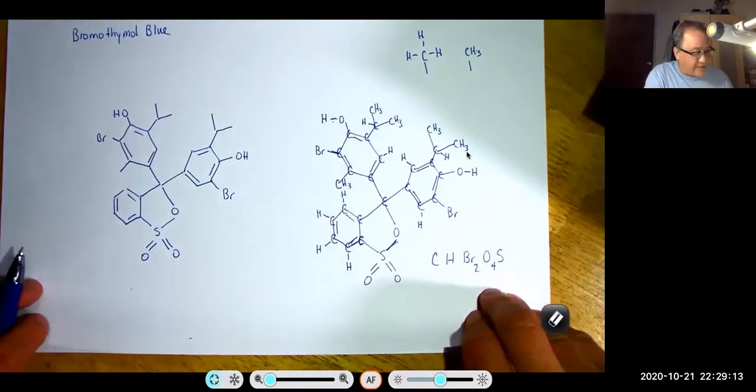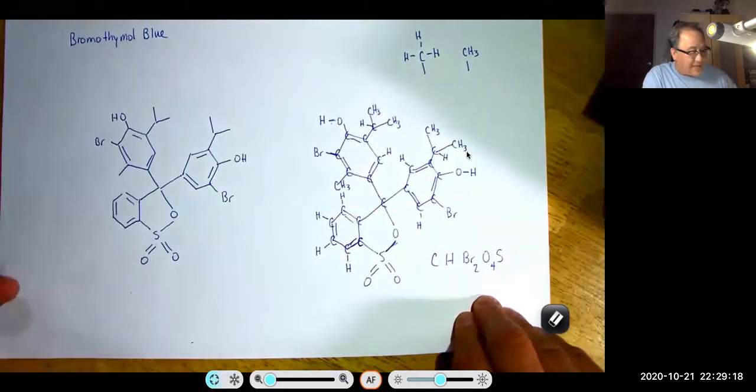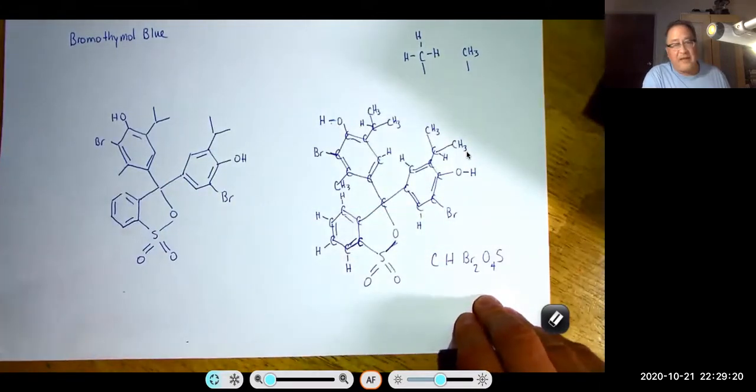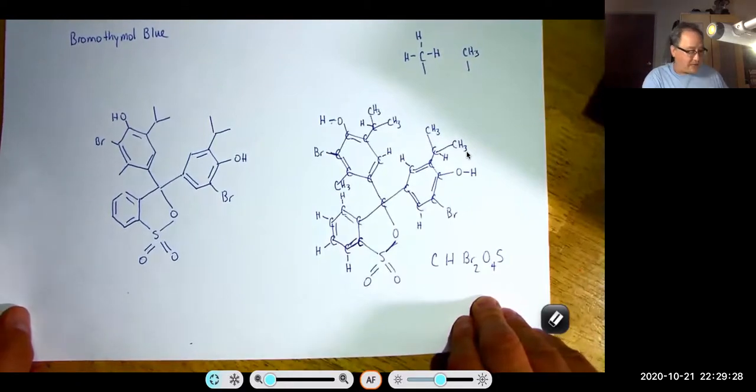You're going to see a diagram in the lab notebook that shows you the different structures. That's something I probably would not write into my lab notebook just because it takes too much time. But the different structures confer different colors on the solutions depending on pH.